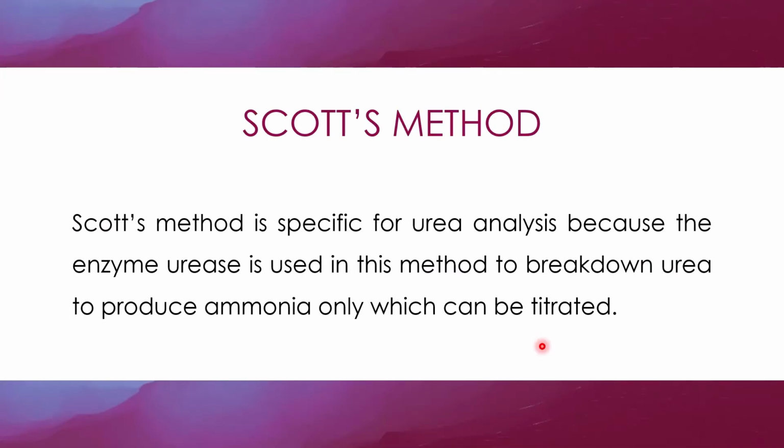Now, let's look at the Scott's method. First of all, what you have to note is that the Scott's method is specific for urea analysis because the enzyme urease is used in this method to break down urea to produce ammonia only, which can be titrated and quantified.